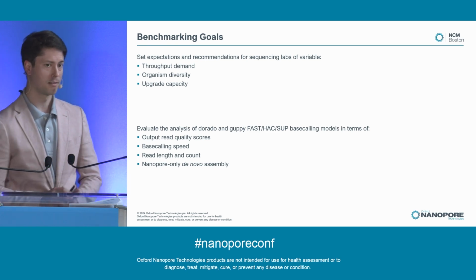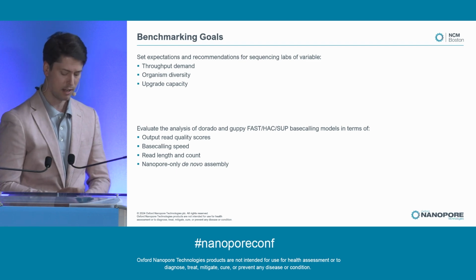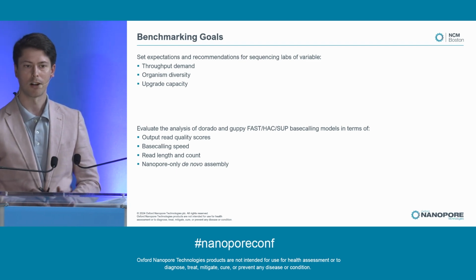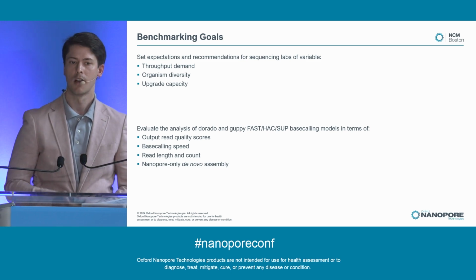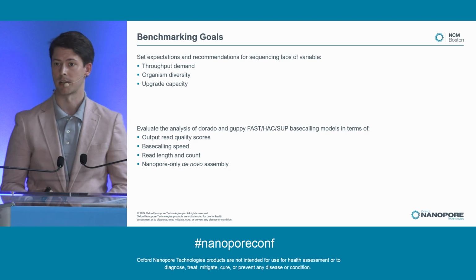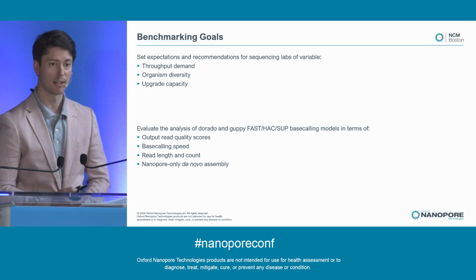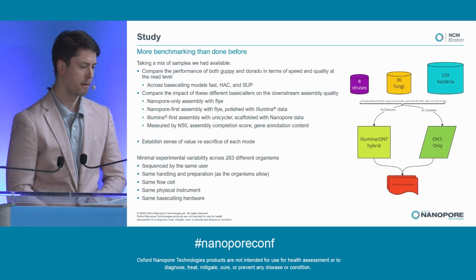And we're still going to keep it high level. It's going to be just assembly lengths, contig counts, N50s, that kind of thing. And obviously these are admittedly very high level and in some ways superficial statistics, but we think these are some of the most universal needs across all sorts of labs. Not everyone needs to go all that much deeper, but these basics will get you where you kind of need to go.